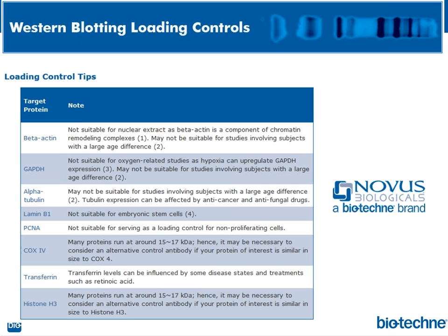And as that membrane is incubating in the cell lysate or the tumor lysate or soups or serum plasma, it's basically just capturing whatever's floating around, until you get an antibody-antigen interaction, overnight at 4 degrees. And thus, the capture antibody is the identifier. That's basically all it's doing, you're just identifying that protein based on its position.